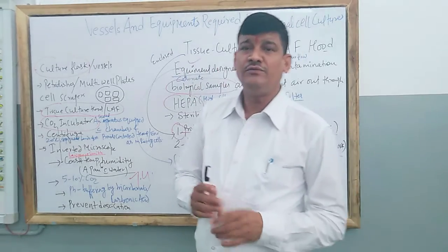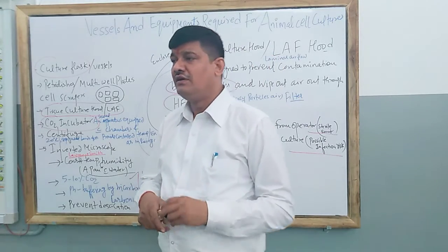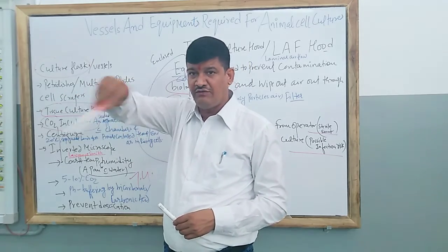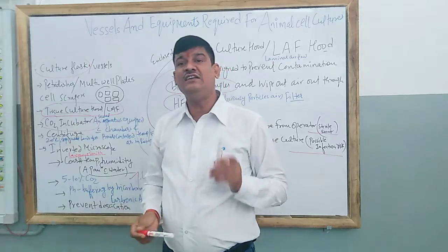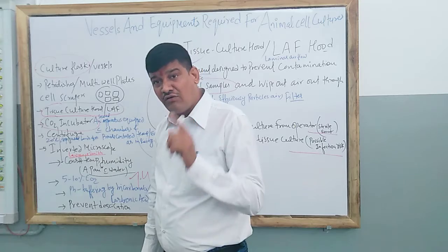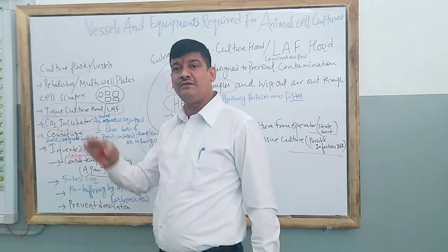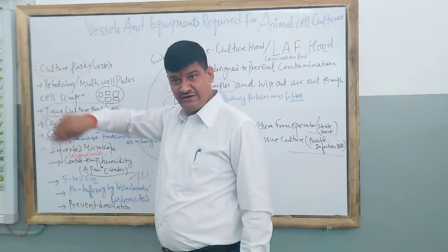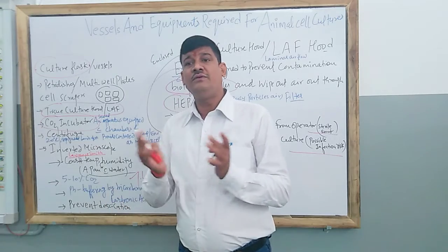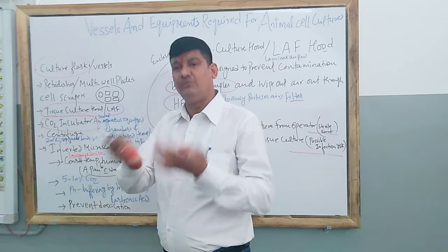Centrifugation or centrifuge is a device, an instrument or equipment. Normally it is used in this circular way, but not at a very high speed. It requires a low speed at 20 degrees centigrade only. If suppose we increase the temperature to 30 or 40, and we are doing the centrifugation at high speed, then what happens? The cells will be ruptured, their plasma membrane or maybe the organelles will come out.